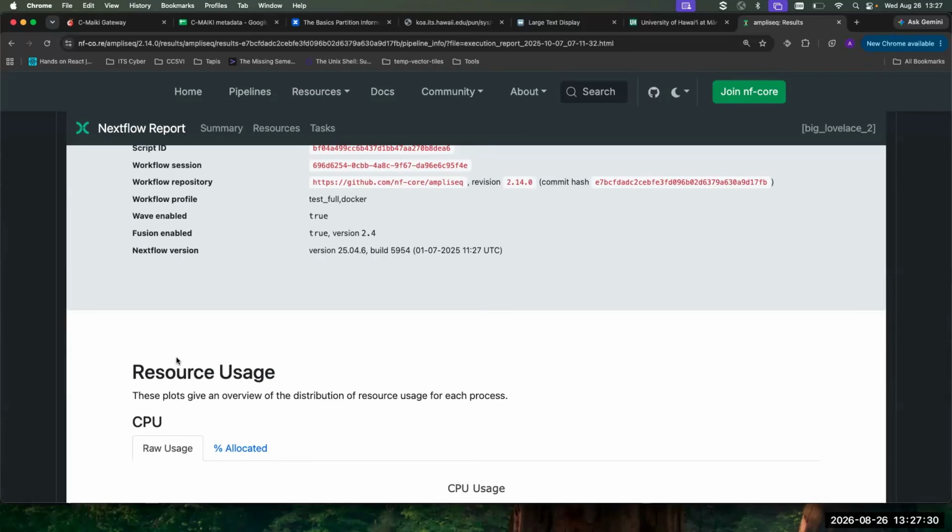And that way you'll be ready if you get new data and have to deal with the metadata file and all that. What's really difficult for people is getting over the metadata file hurdle when they're anxious to run a pipeline. So that's the part that we really want you to preempt, is basically try something old, make it work first so that you're ready when you finally get new data. Any questions?